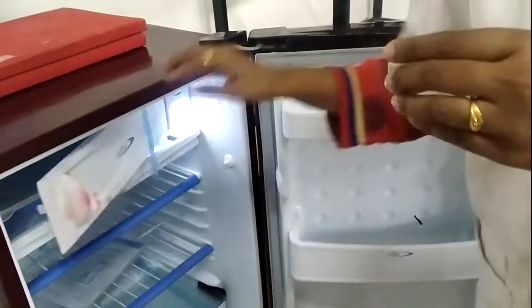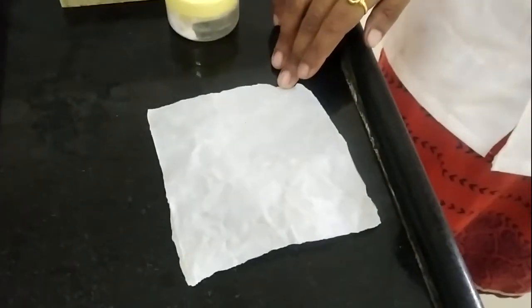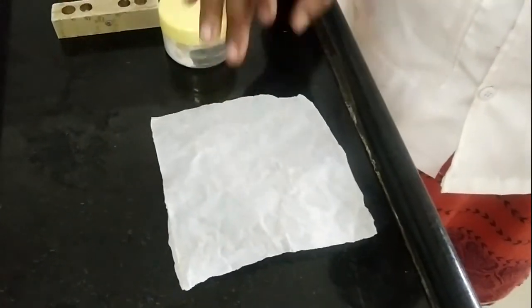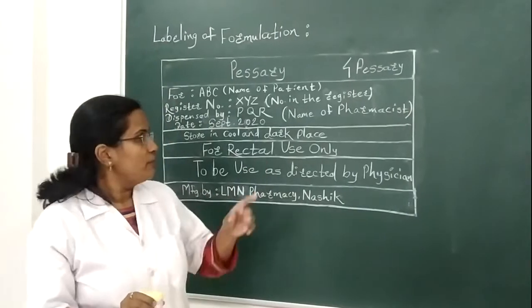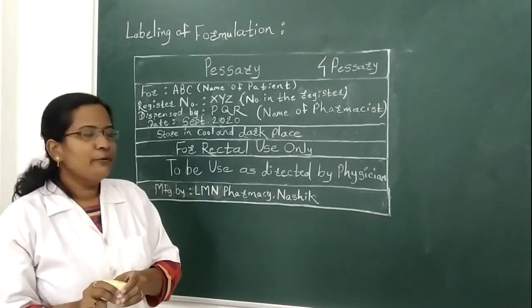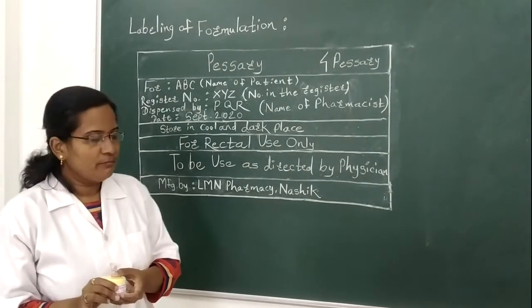So now I am going to wrap each suppository separately in butter paper and then store them in this wide mouth container.